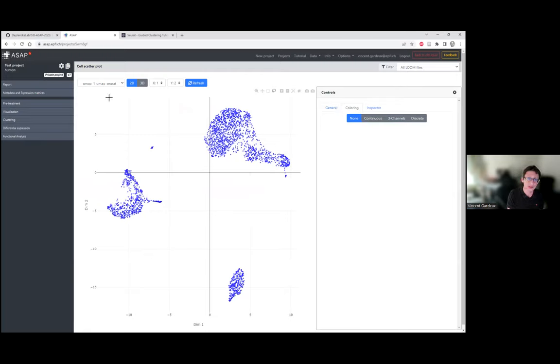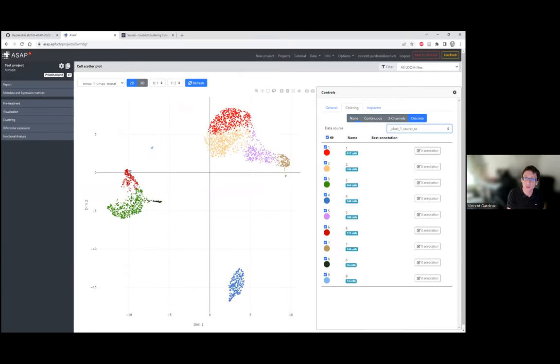So we can visualize it on the UMAP. If you go back to the visualization step, this time you go to the discrete option, because it's categorical, or discrete, metadata that we are using. And then you see the three clusterings. The first one is the one with the 0.5 resolution. Here you see the 9 clusters that were generated, and the number of cells in each of them. If you hover with your mouse, you can see the cluster the cells belong to.